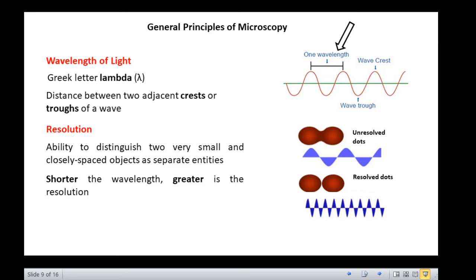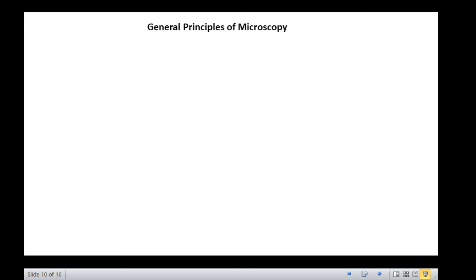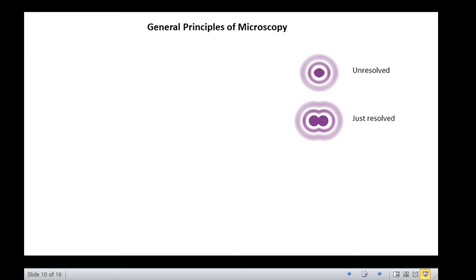Well, so just to find out whether you have understood the concept of resolution, what do you think of this image? Yes, it is an unresolved image. What about this? It is a just resolved image. And finally, this? Well, it is a fully resolved image.